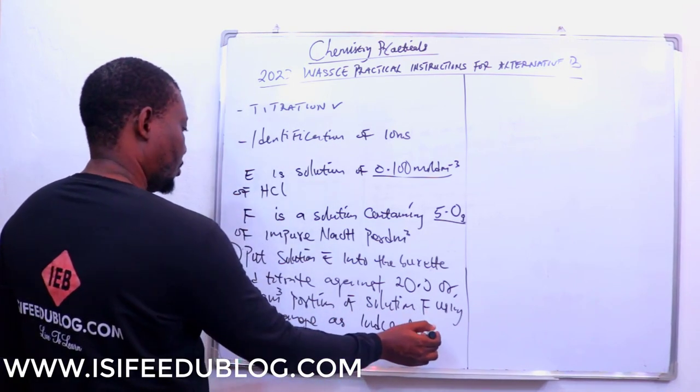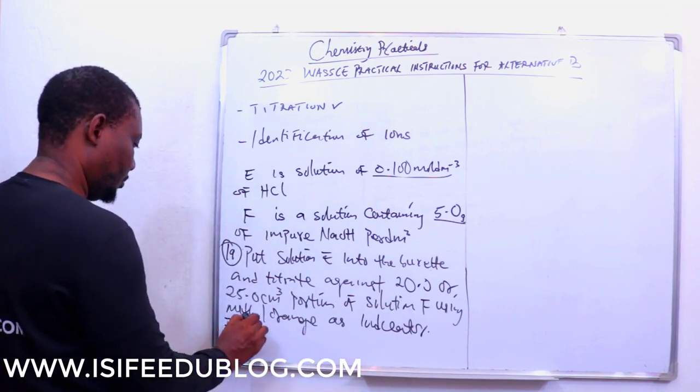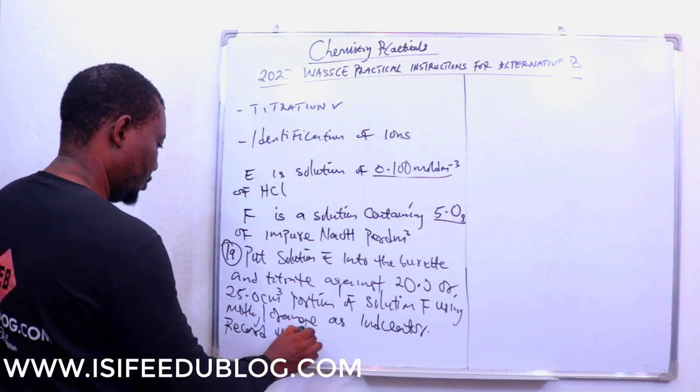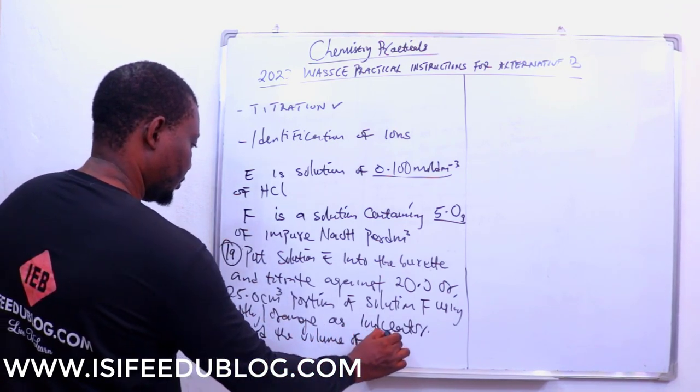Full stop. And then you're going to see: record, very important, the volume of your pipette.